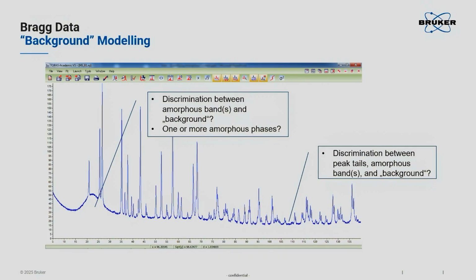For example, air scatter, essentially the instrument background. Most of the instrument background is air scatter. You may have scatter from some components of your instrument. Normally, in our experience, that is not dominating. So most of the scatter you see is air scattering, and it is most prominent at very low angles two theta. So you will, as you come close to the primary beam, see more and more air scatter. So the background, or what seems to be background, is always getting high at lowest angles two theta. So we have air scatter, maybe instrument components. What else?